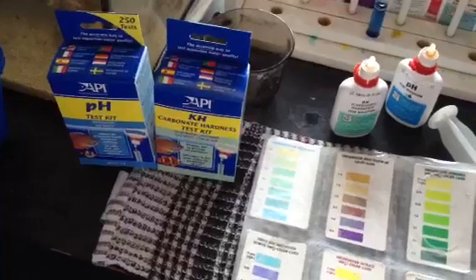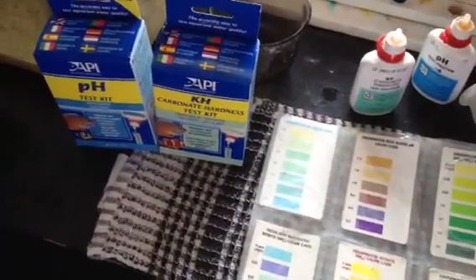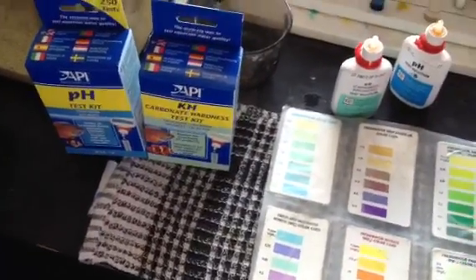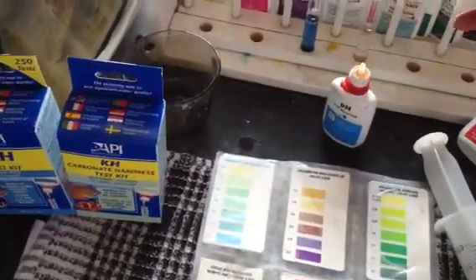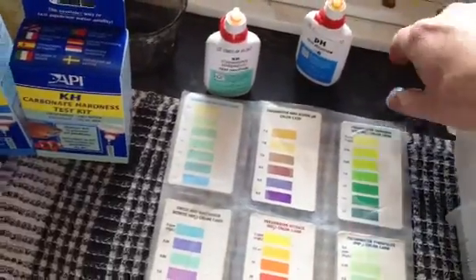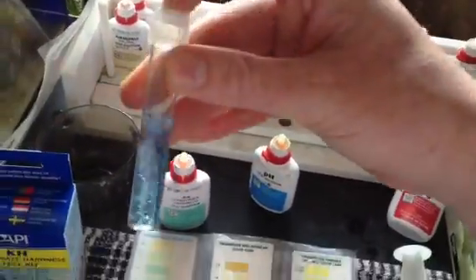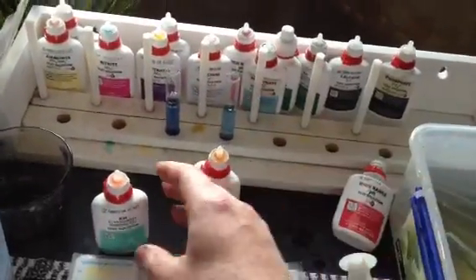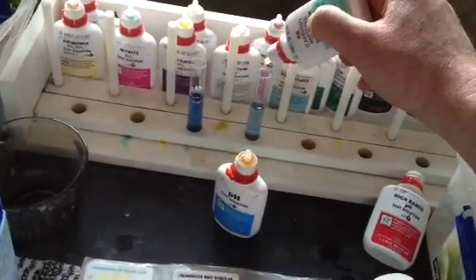The way you test KH is different — there is no color chart for KH. It's a titration test, which means you're counting the drops until it changes color. We put the same amount of water into the test tube, then put in one drop of KH solution. Put the lid on, shake it, and the color comes out blue. You don't count the first drop, because that is the reagent drop.